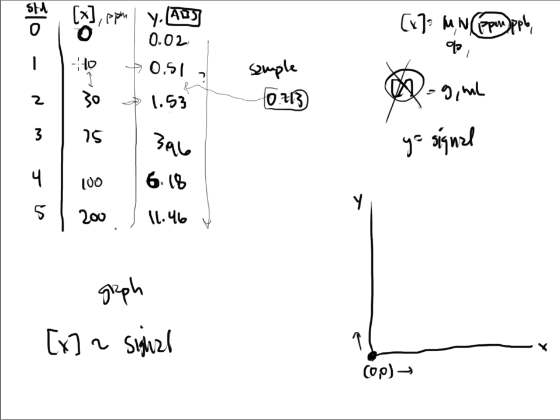Well, if I look at this 10, 0.51, and 100, well, that's 10 times the amount. What's 10 times 0.51? Well, that should be like 5.1, not 6.1, right? So because of that, I'm going to maybe realize that one of these standards is kind of out of whack. And we'll see that when we eventually begin to plot them using Excel.